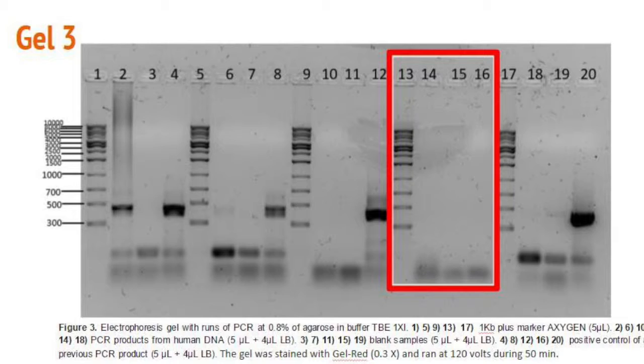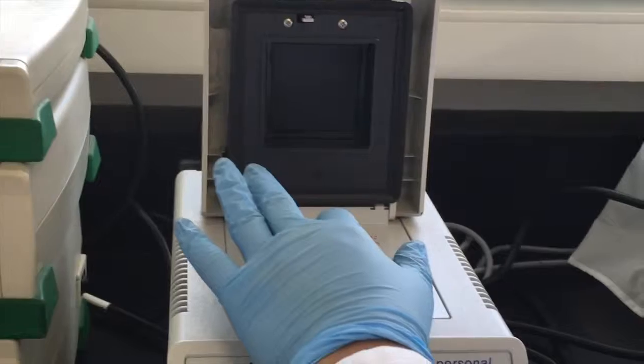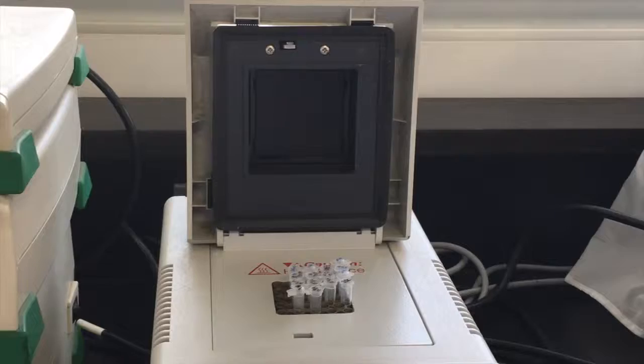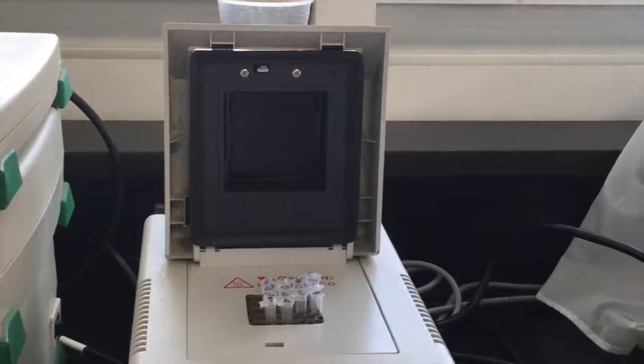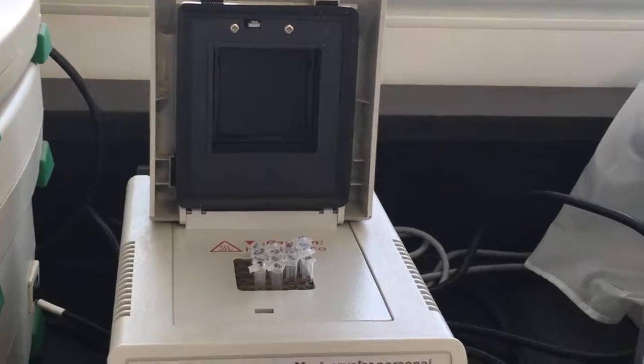The results of electrophoresis of PCR products reflect an error in the procedure. The wells do not present contamination, which indicates a good control in the reactant distribution. The lack of results in both the DNA well and the positive control indicates a problem while performing the PCR. The rest of the samples were processed in the same thermocycler, which indicates the machine worked correctly. The error can be in the PCR components such as the DNA polymerase or the primers when they were added to the master mix. If the master mix was not prepared correctly, the PCR will not take place.